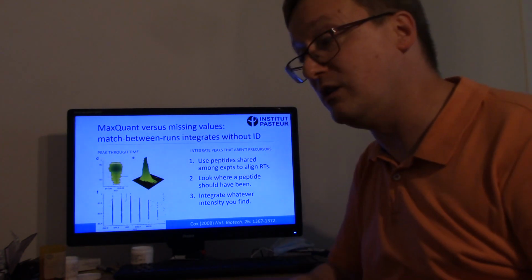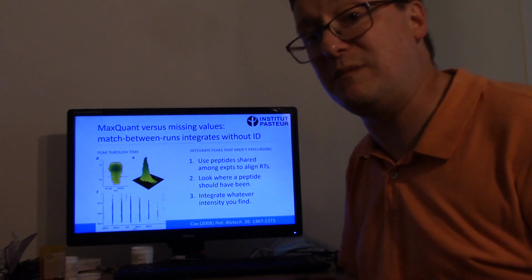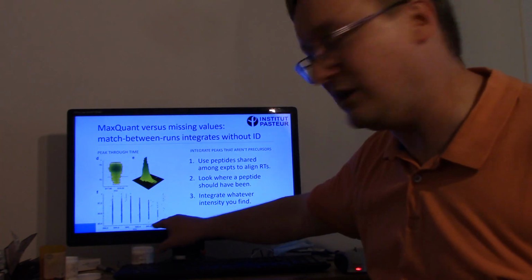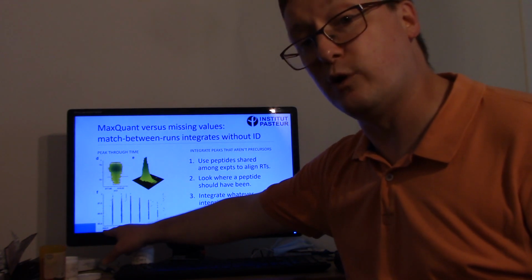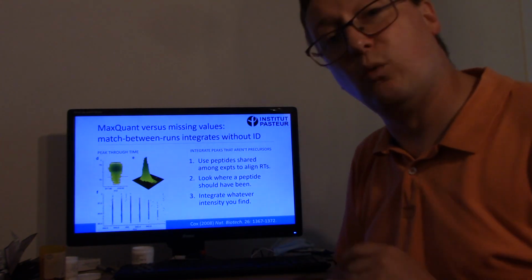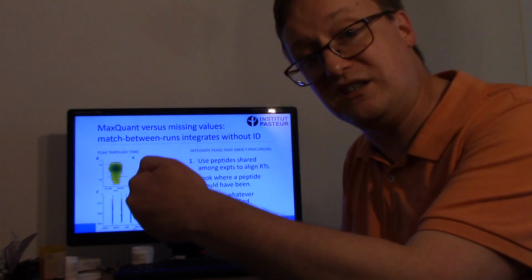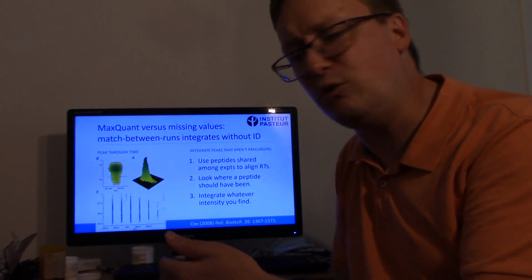Some of them come from a very intense signal, and some of them come from a very weak signal. We know that when the peak is intense, we get a better, more accurate estimate of what its mass to charge value is. But we also have another way that we can evaluate these. Now look how wide this m/z range is: 844.2 up to 845.8. What we're looking at is an isotopic packet. We have the monoisotope, which is like all carbon 12s, all oxygen 16s, and so on.